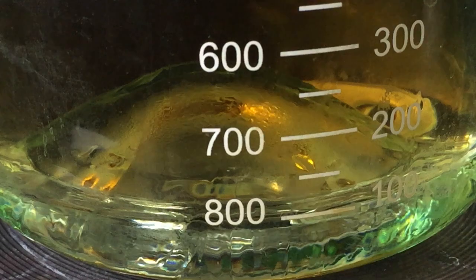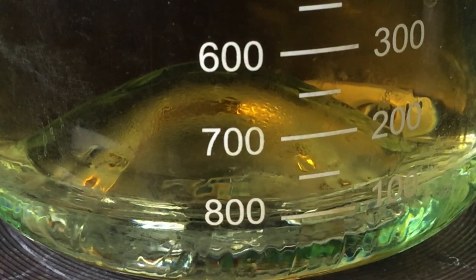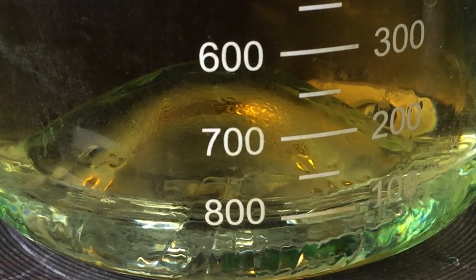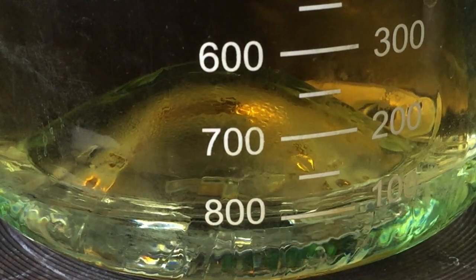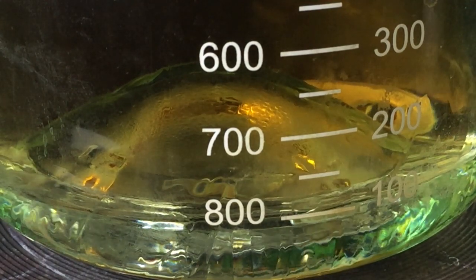As the burner heats the bottom of the pan, you'll see these beautiful columns rising up as the oil at the bottom expands and flows up along the side of the bottle. It's the fact that the heat moves freely around the bottle that protects it from thermal shock and that keeps it from breaking.